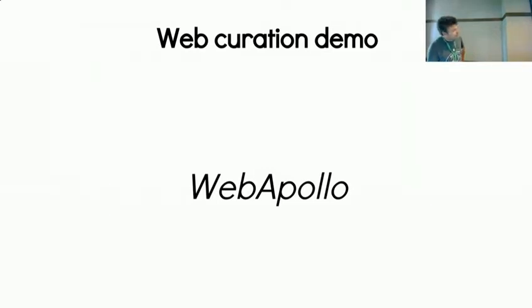As you can see, in this Galaxy you're running, see in the top corner, well, this is your one, but on our one, it says galaxy/GVL. You want to talk about how we have WebApollo and Postgres all set up? Is that working yet, Simon? It is on a test server.